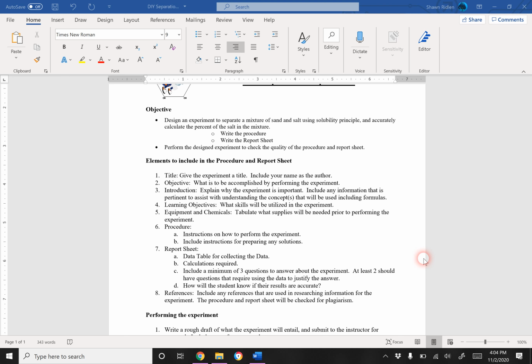Obviously, if I just gather up all my glassware and equipment, I still can't do the lab without having the correct chemicals. Make sure you list everything there, even including something like, do I need water for the experiment? Think about someone doing this in a lab somewhere, and they need to have everything they need for the experiment, including the chemicals and all of the equipment.